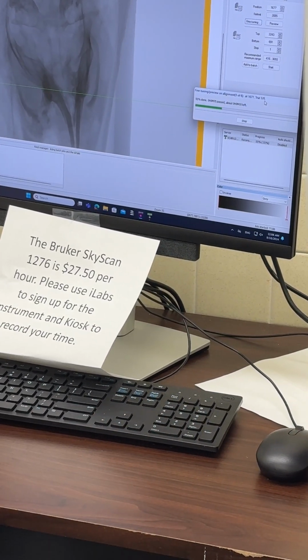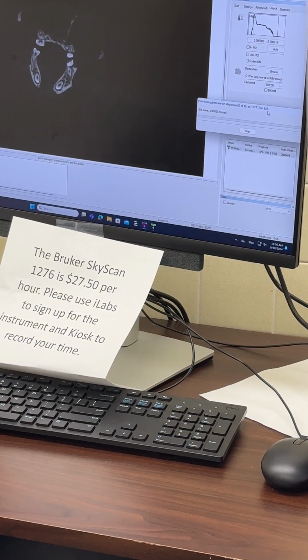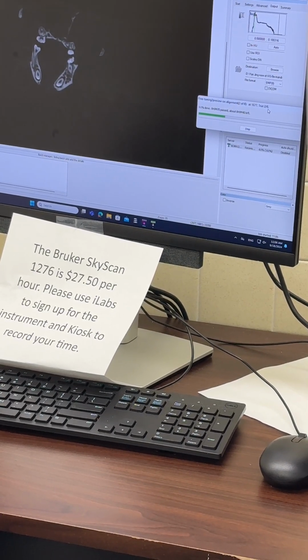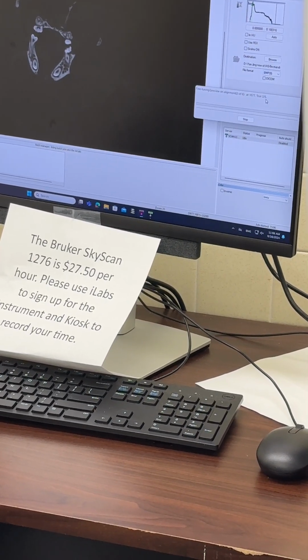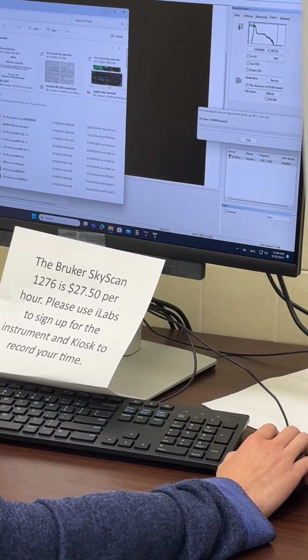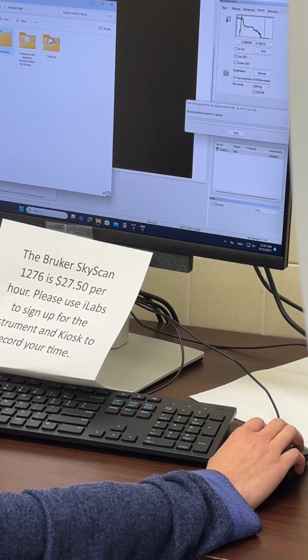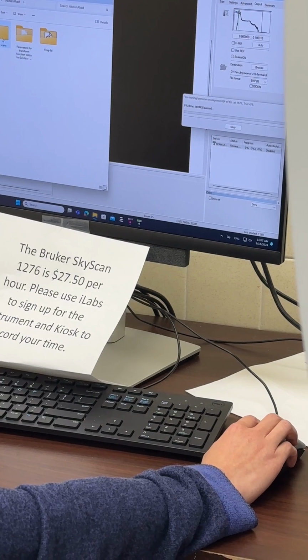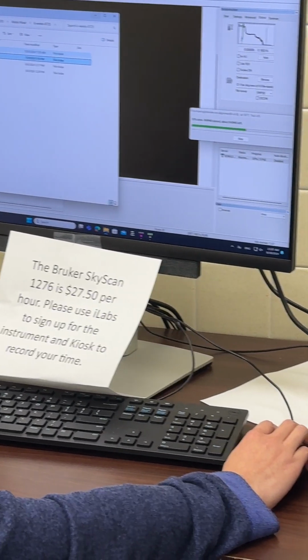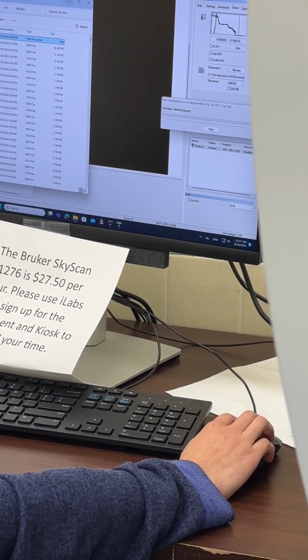Do you have the picture or setting for your previous one? No. So I think I may have it, if we could find the day that we did it. Okay. Yeah. So it should be on here, because the reconstruction data. I don't know, does the reconstruction data have the setting record here? Which one? 6 weeks, 075. So you did some reconstruction before? So this is the one that you did, remember? Oh, Dr. Chen, when we were doing the addition. So this is the one. Let me check this.